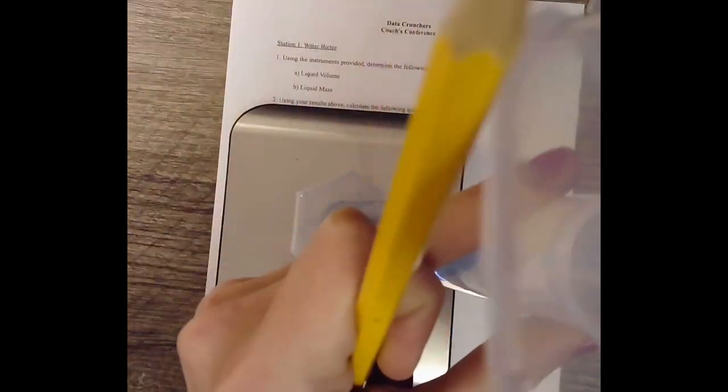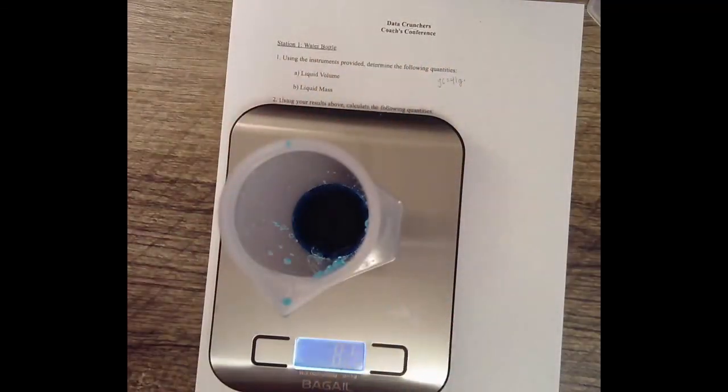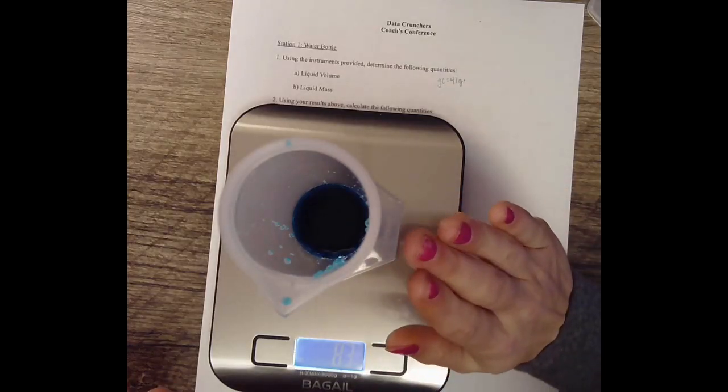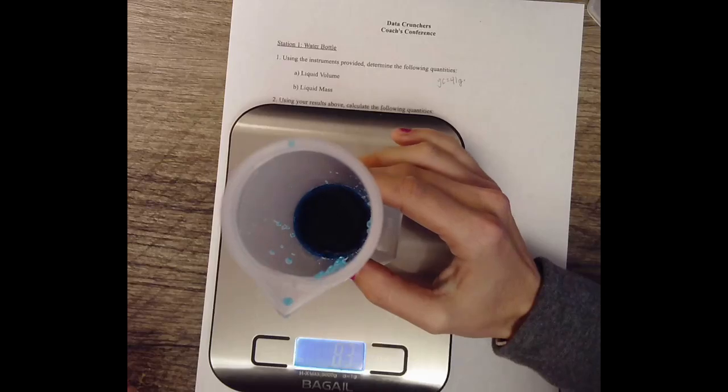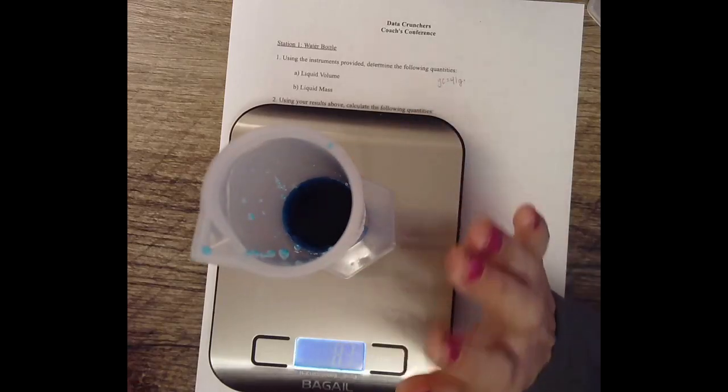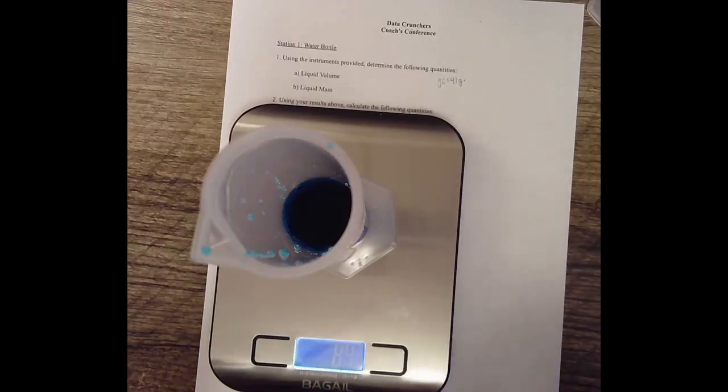When you guys, oh sorry, I know you can't see anything because of the camera. When you look at your graduated cylinder and you get eye level, you might notice a small, slight dip, and that's okay. You're going to want to measure at the smallest point.